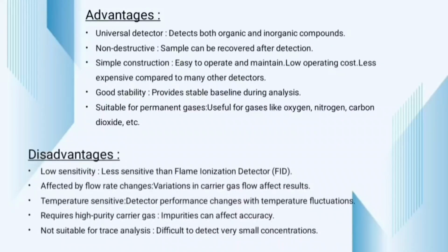Advantages and disadvantages of TCD. Advantages: it detects both organic and inorganic components. Samples can be recovered after detection. Provides a stable baseline during analysis. Useful for gases like oxygen, nitrogen, carbon dioxide.